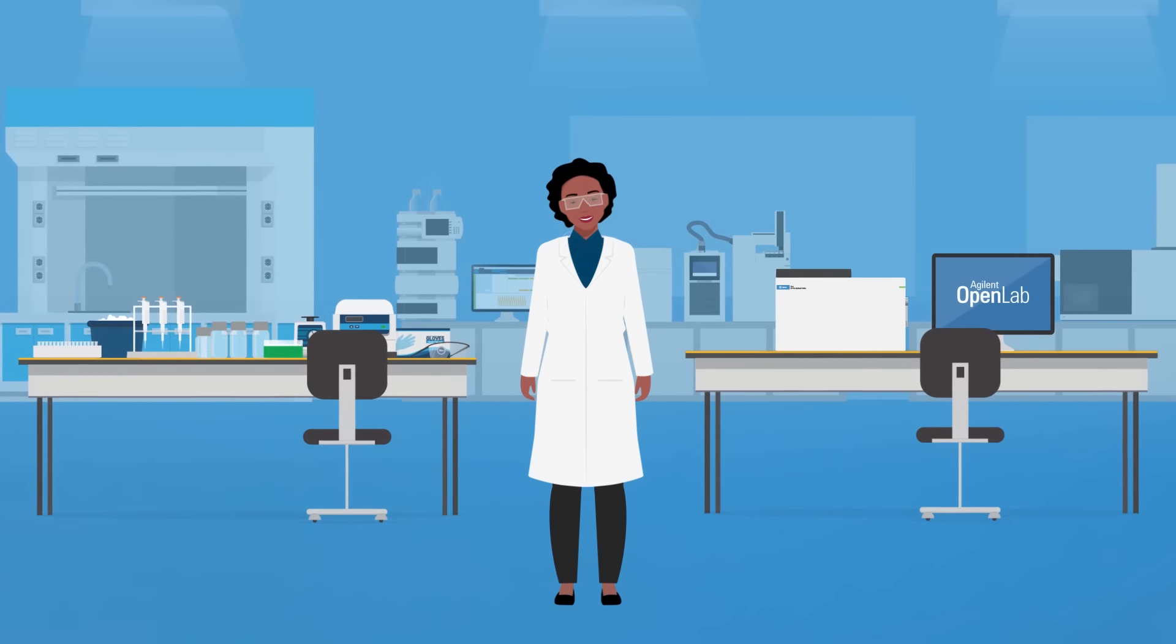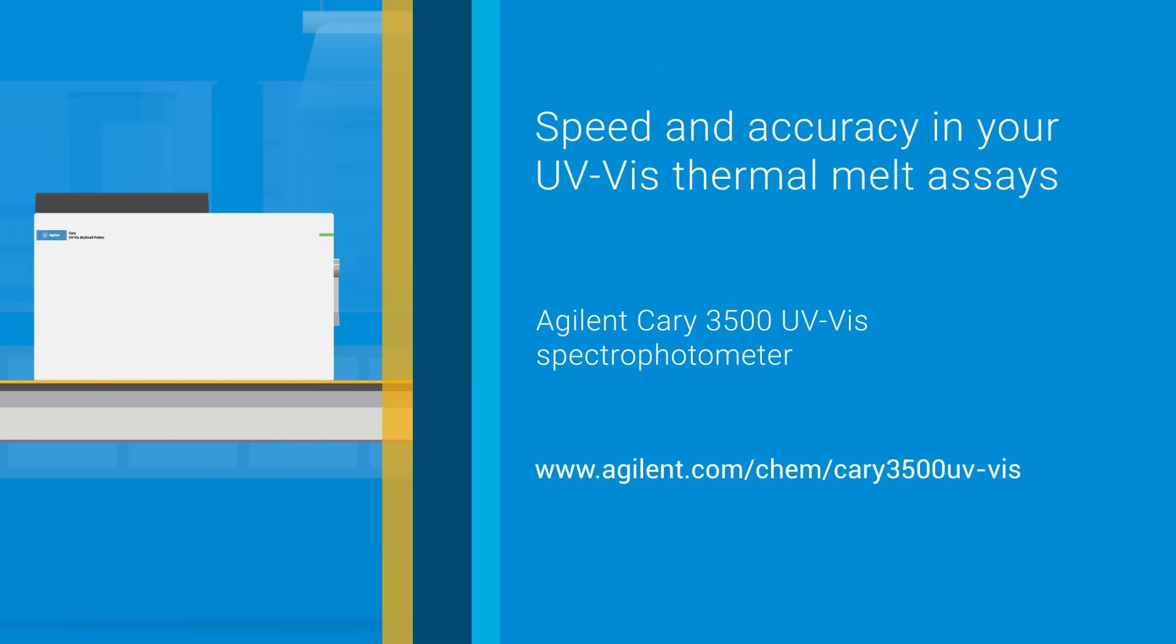To see how your lab can benefit from speed and accuracy using the Cary 3500 spectrophotometer, go to Agilent.com.